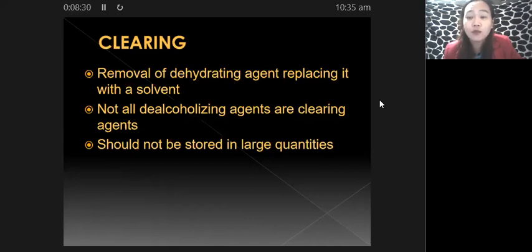So, yes, in short, for this video, I will be discussing the next step that we have to perform in tissue processing, and that is the clearing step. Okay, what are the purposes of clearing? And yes, ano bang ibig sabihin ng clearing? What are we trying to do when we are performing the process or the step of clearing your tissue samples, okay?